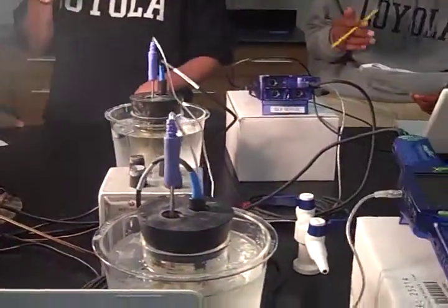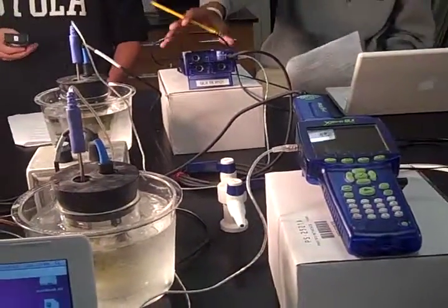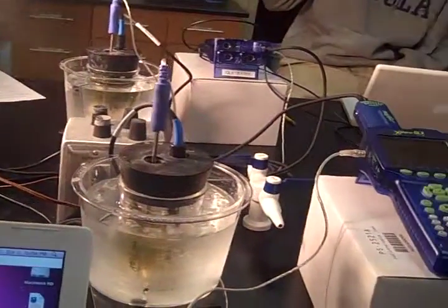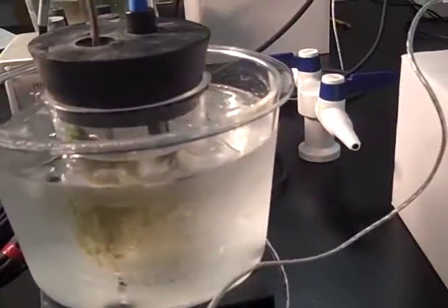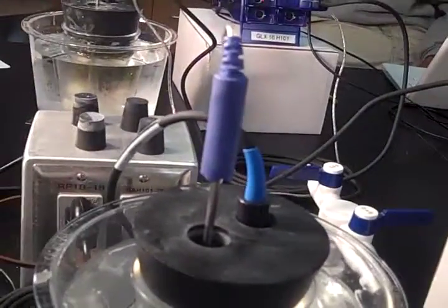The purpose of this lab is to notice the changes in the release of oxygen from a controlled group of a simple cup of water to a group with a plant that has a pre-existing amount of oxygen. As the light shines upon the plant, it synthesizes the effect of photosynthesis, which in effect releases oxygen from the plant, which would change the amount of oxygen in the total experiment. The equipment for this experiment required a Mac computer with Data Studio, a GLX, a Pasco photosynthesis tank, a large rubber stopper, a temperature sensor, a dissolved oxygen sensor, as well as an Elodea plant.